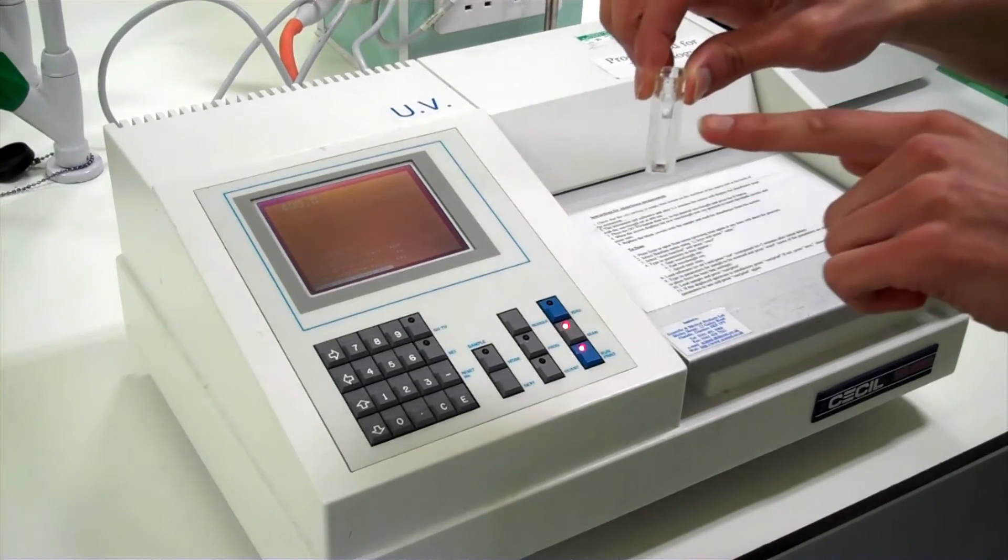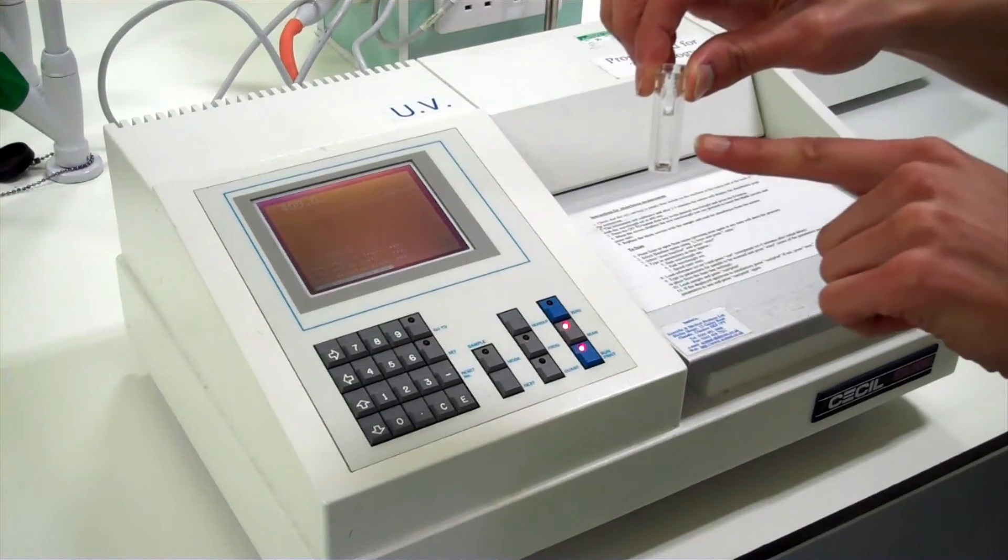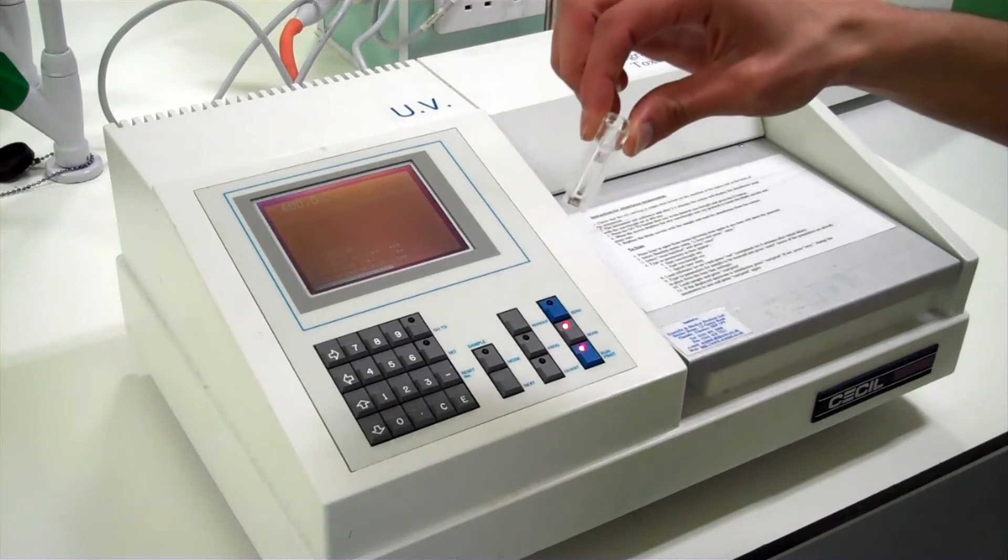Notice how the cuvette is around two thirds full. This ensures that all the light from the spectrophotometer is passing through the solution but is not too full to spill over easily.